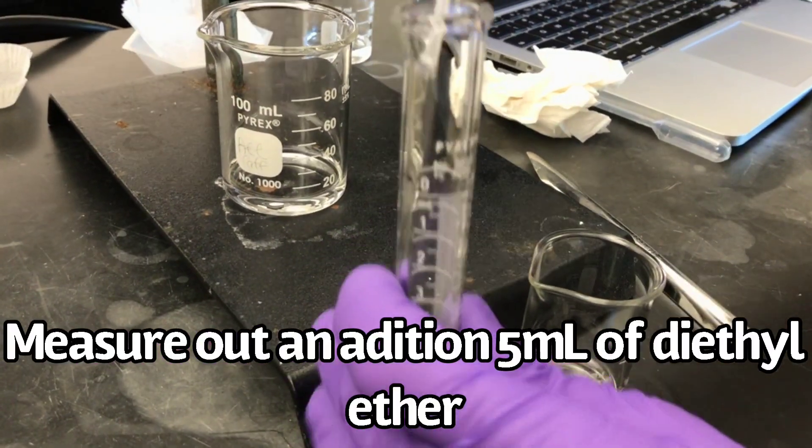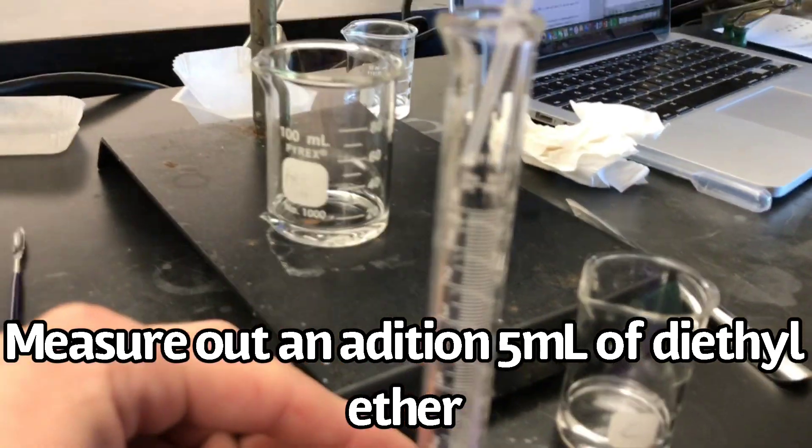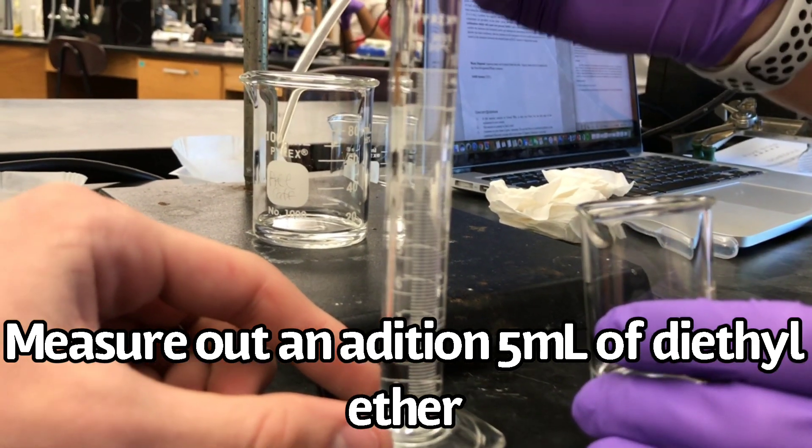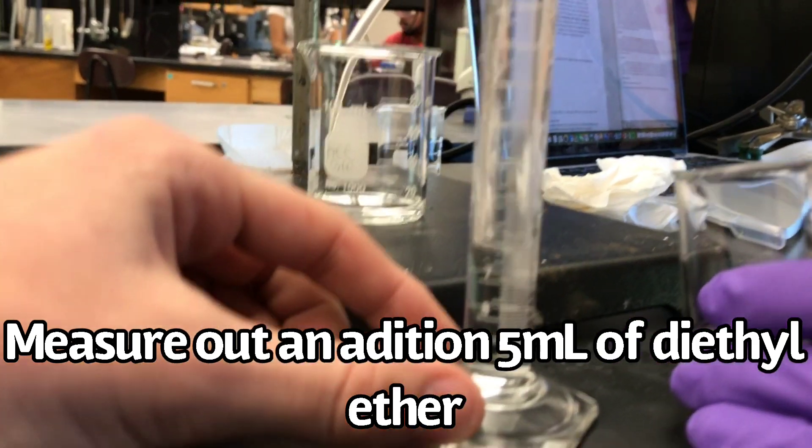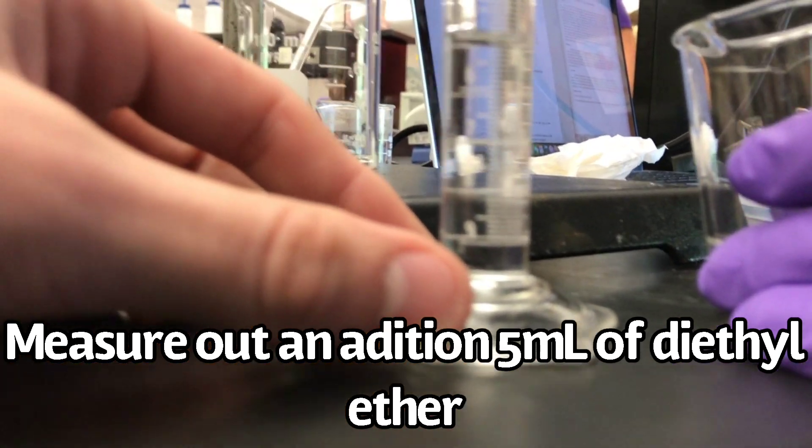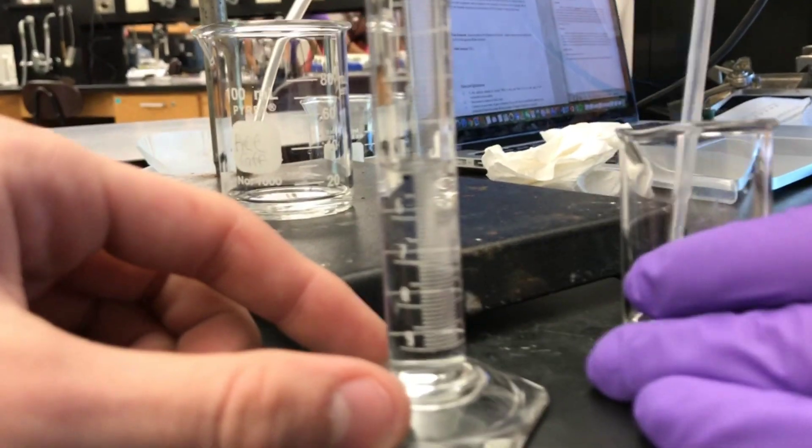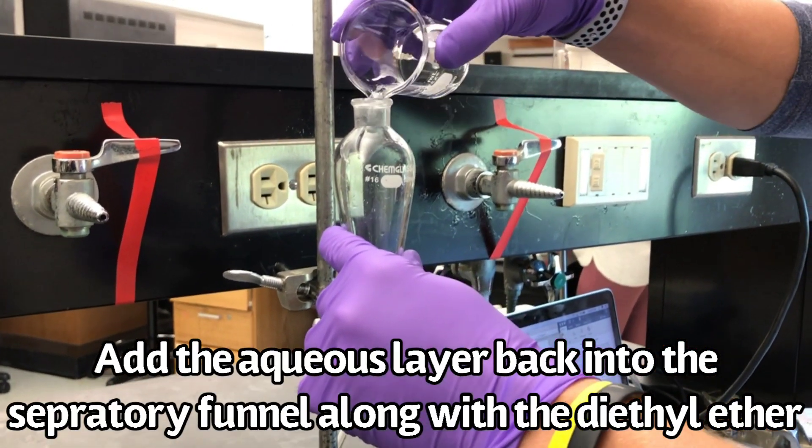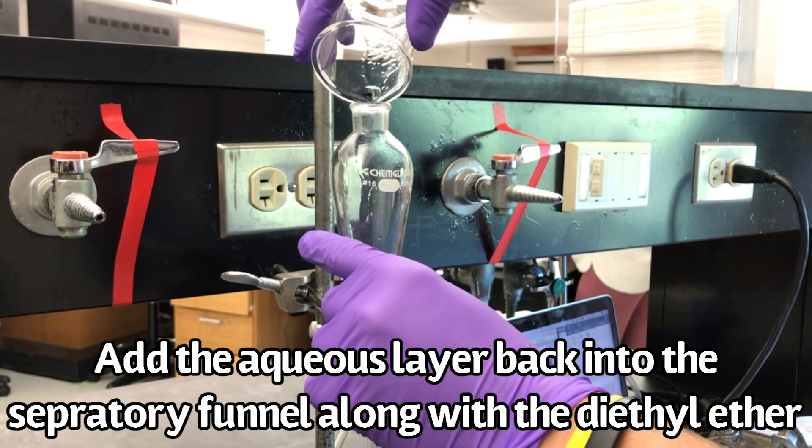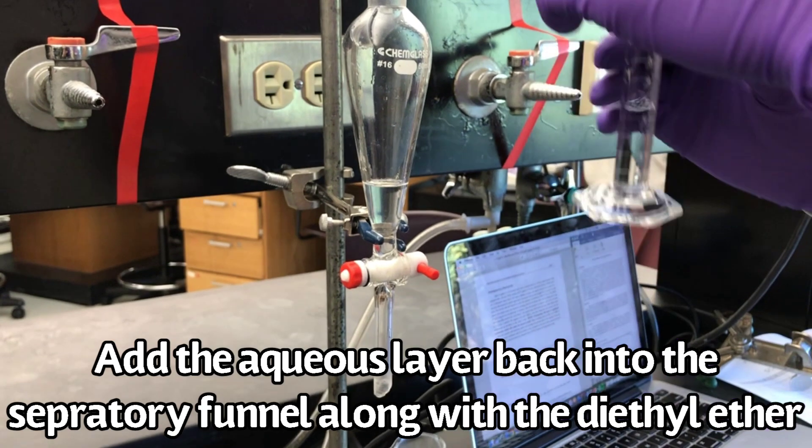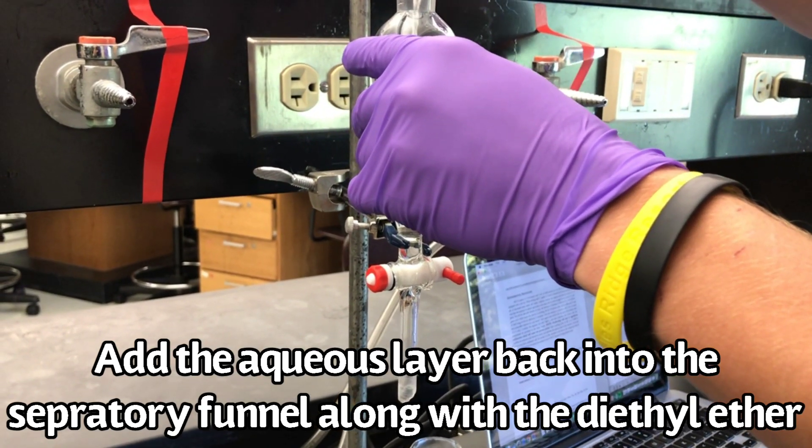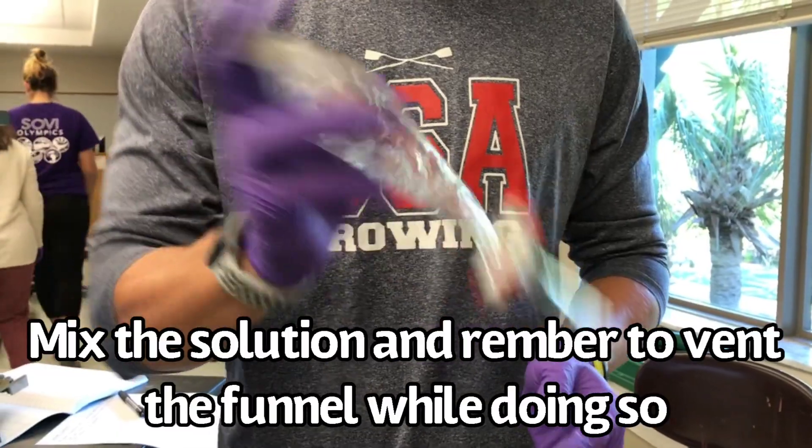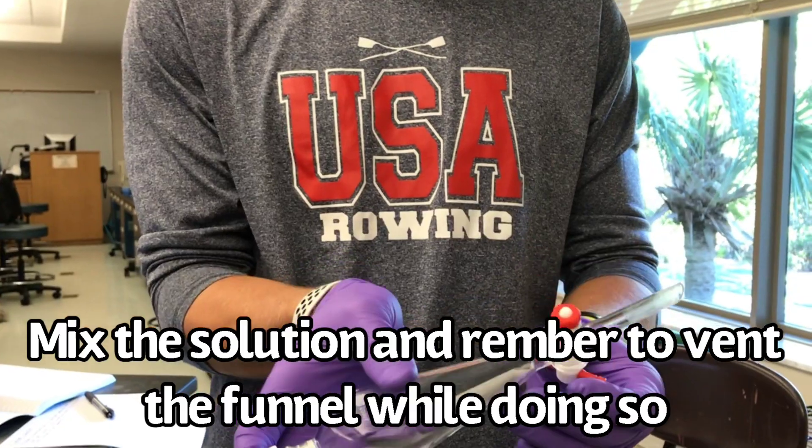Measure out an additional 5 milliliters of diethyl ether. Add your lower aqueous layer back into the separatory funnel along with the diethyl ether. Mix the solution and remember to vent the funnel while doing so.